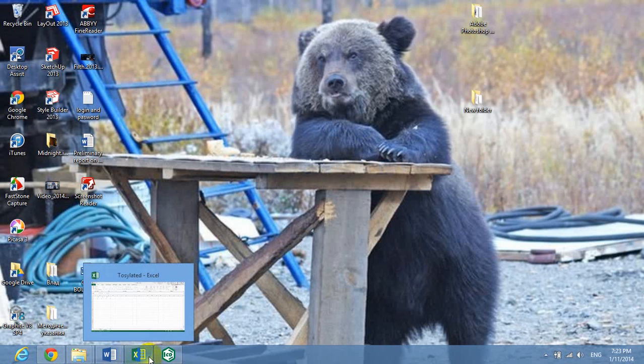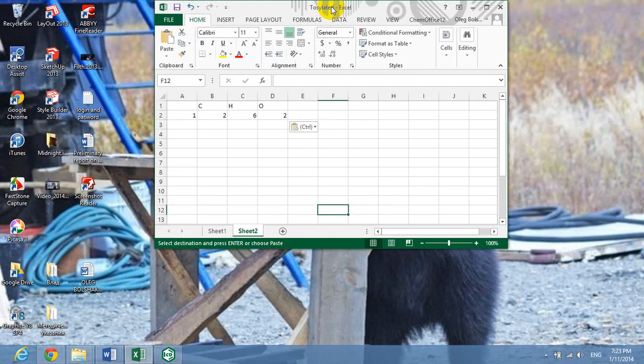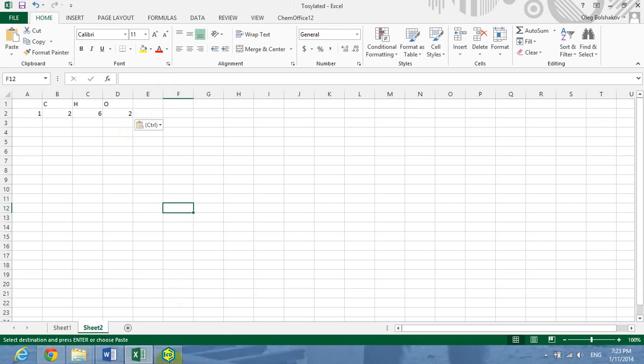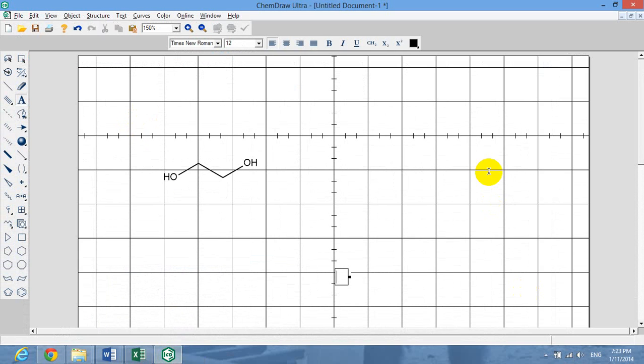Hello there. As I have received your request for the calculating of the masses, we're gonna use a regular program for the calculations. The most convenient one is gonna be Microsoft Excel. To start, we have to draw the structure in any available graphic editor.